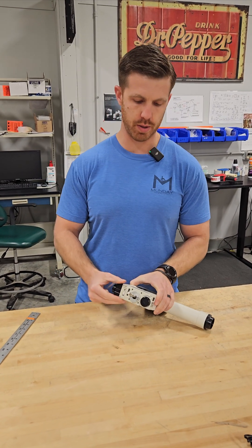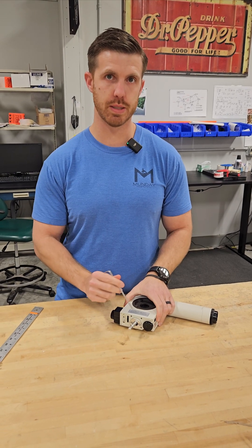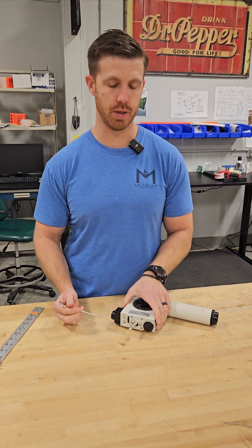This particular customer's unit had failed, so we're going to send them this replacement and they're going to send us back theirs so we can make the repair.